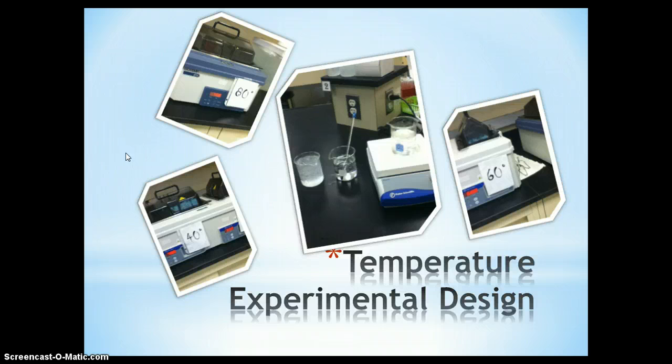So prior to the experiment, our potato extract was put in ice. But if we added the potato extract and the catechol immediately and stuck them in the temperature we wanted to test for, that would not have helped our results.